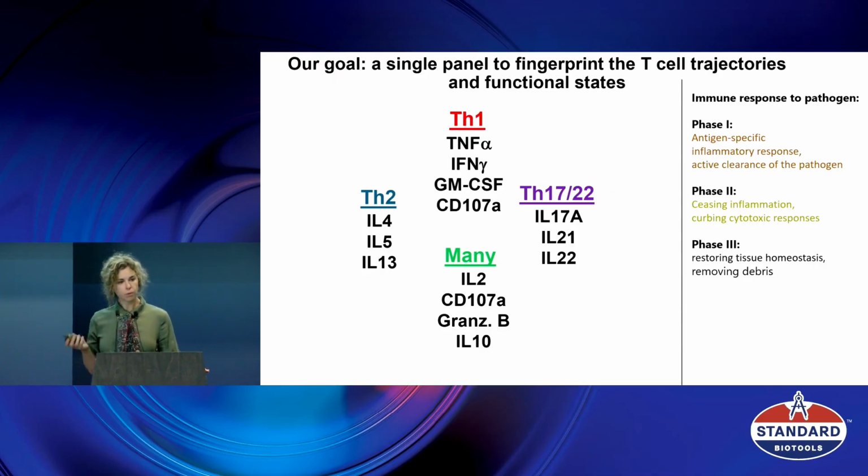So we made a small list, and my major methodology at that time, and that I utilize up to this day, was flow cytometry. I was like, yeah, we will make a flow cytometry panel. I'm fully confident we can do this. We can go not really super big, maybe 30 colors, and measure the cytokines along with the surface markers.